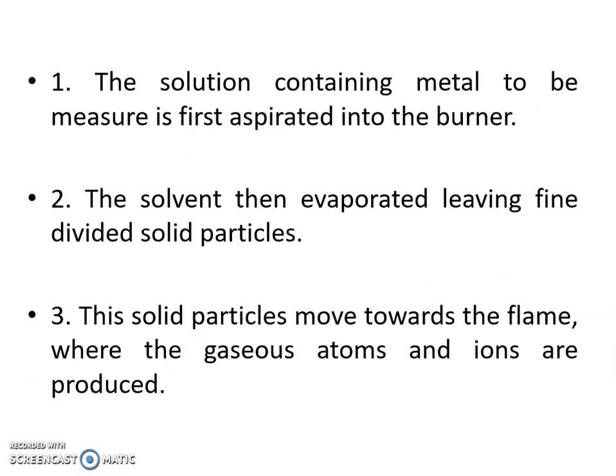Now, the solution containing the metal to be measured is first aspirated into the burner. Second, the solvent is then evaporated, leaving finely divided solid particles. The solid particles move towards the flame, where the gaseous atoms and ions are produced.